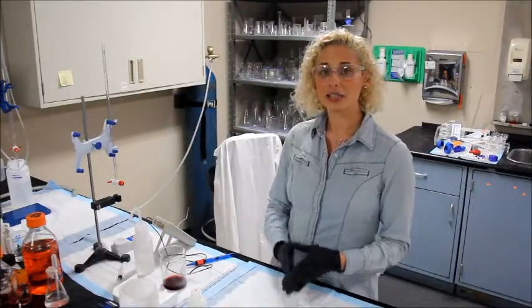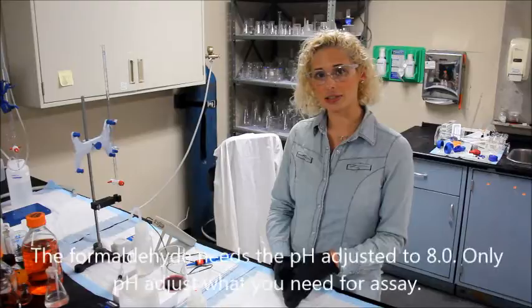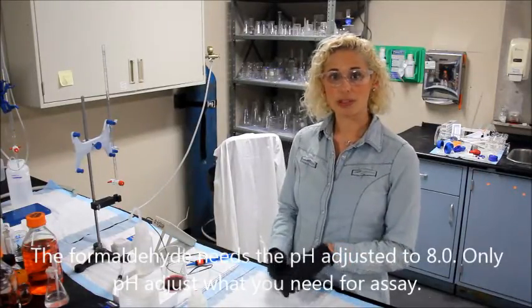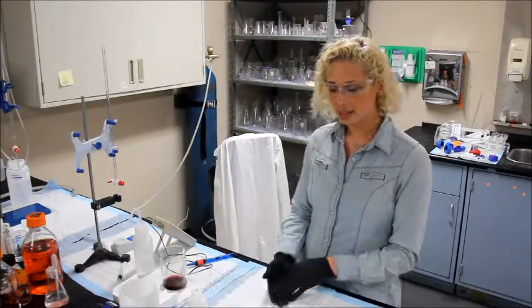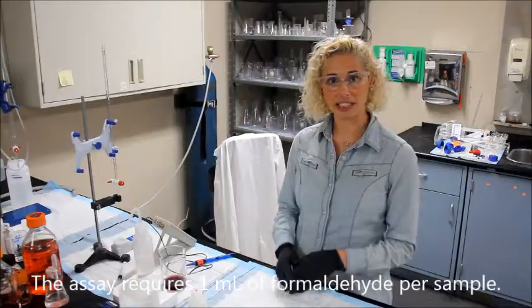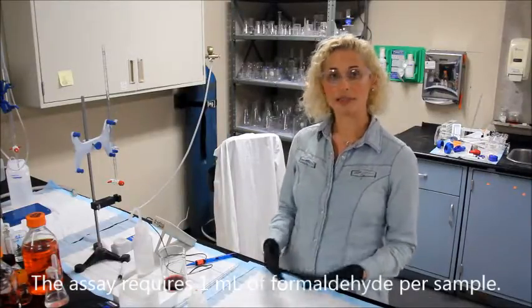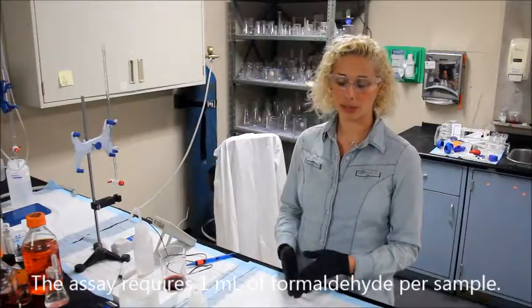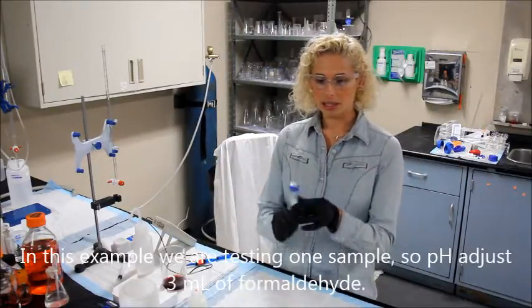The formaldehyde used in the assay needs to be pH adjusted to 8.0. Only pH adjust the amount that you're going to be using for the assay. The assay requires one ml of formaldehyde for each sample. I'm only going to be testing one sample, so to make sure I have enough I'm going to pH adjust three mls, which I already have here.